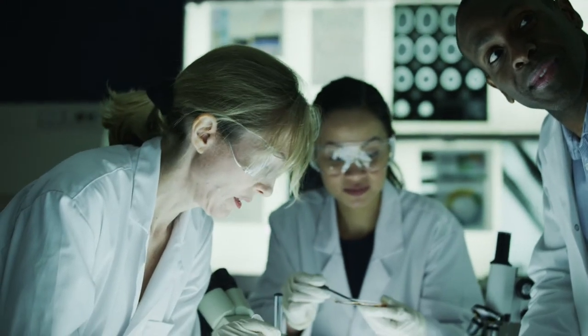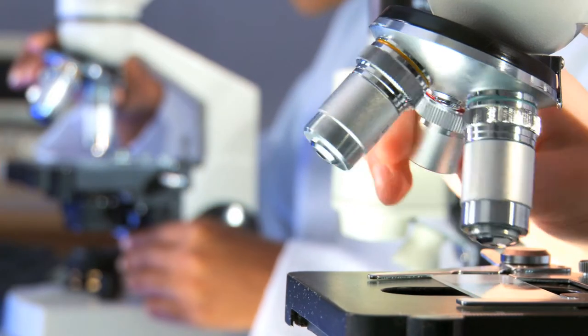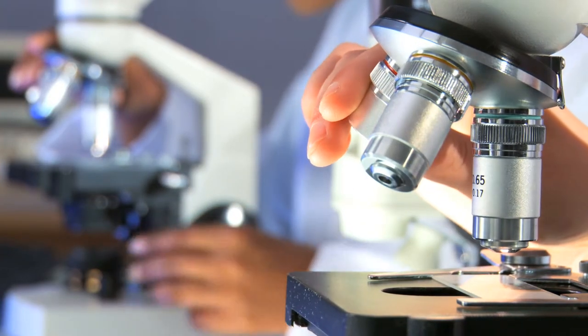Because it requires very little technical expertise, oversight, or maintenance, the Primer allows you and your team to focus on high-level objectives and priorities related to your science and research rather than instrument upkeep.